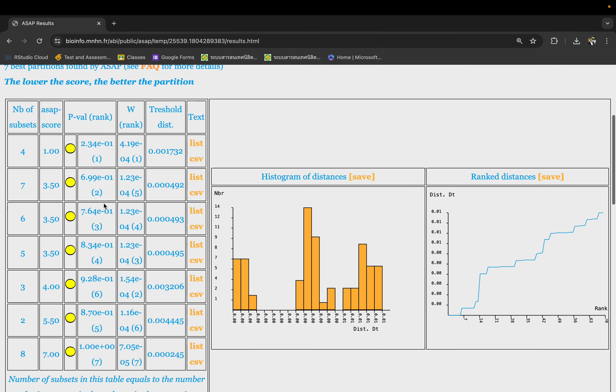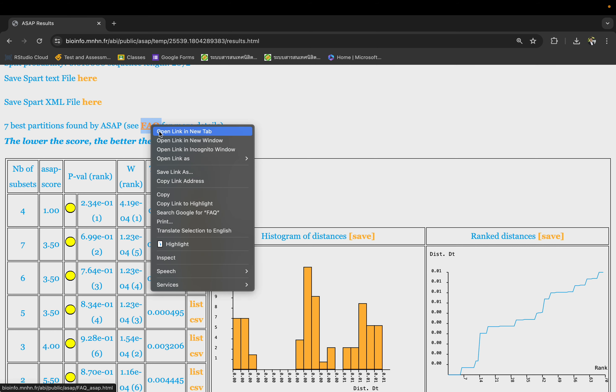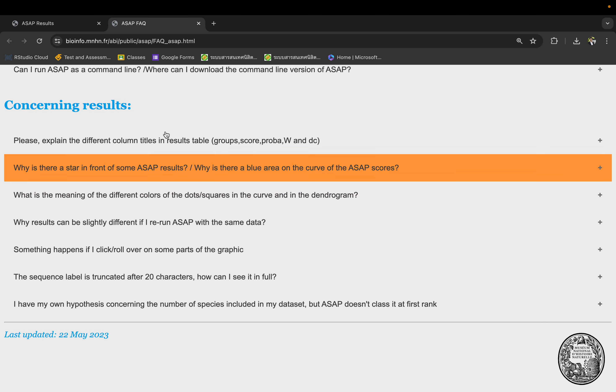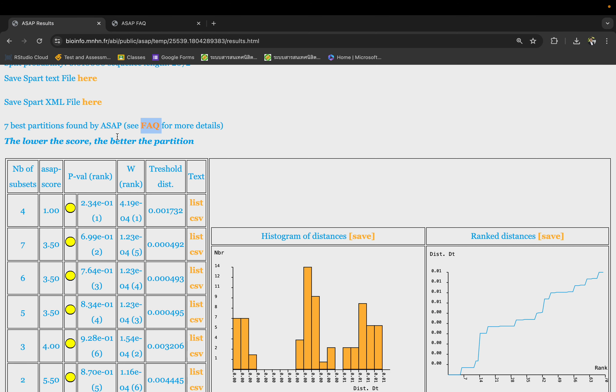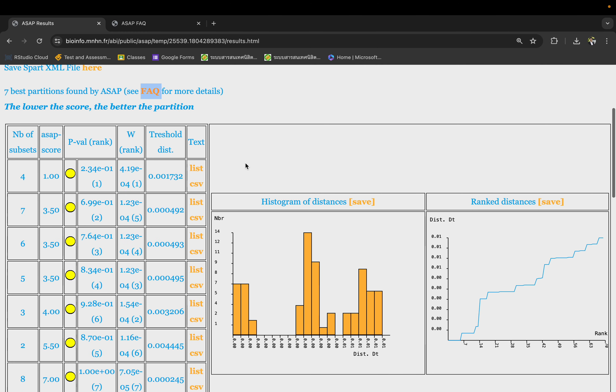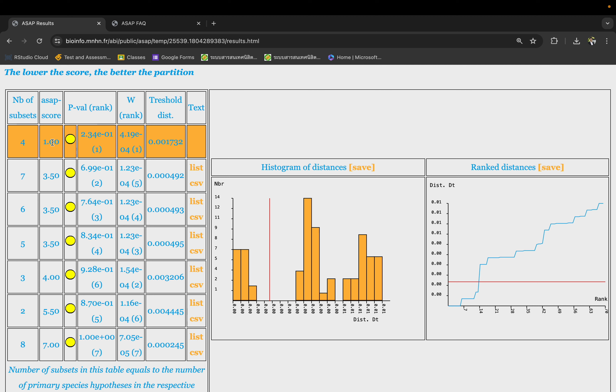Here is the main result you want to look at. The best number of subsets should be on the first row here. So the best number of subsets, or number of species you recover from this sequence, is four species. The ASAP score - the lowest is better. That's a threshold for how they separate within species from between species.